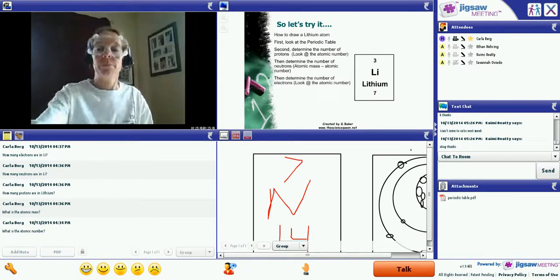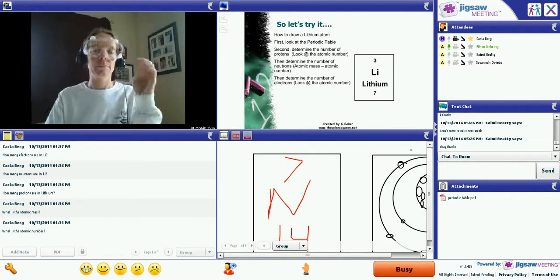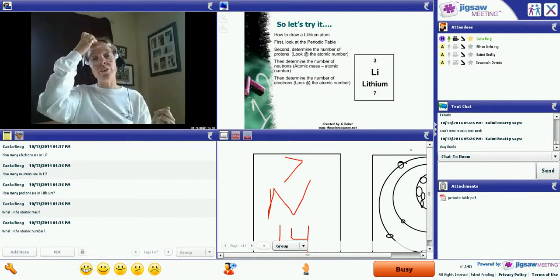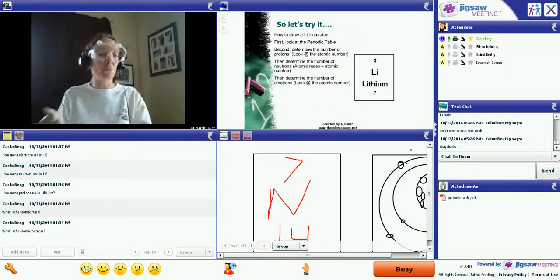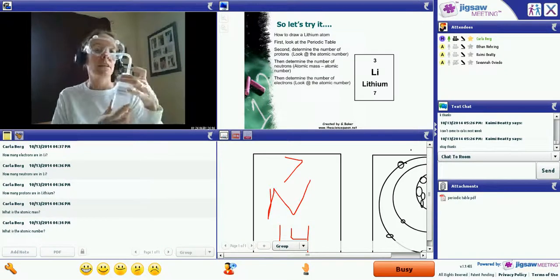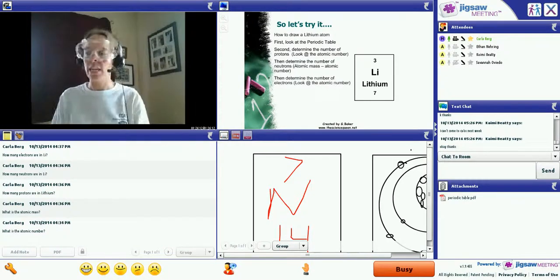Ethan, you have a question? If we can't rinse them in distilled water, should we just wash them with soap, like dishwashing soap? And should we wash the plates with dishwashing soap? Yeah, if you don't have distilled water, you don't even really need to use soap on it. Just rinse it out real good with water. The distilled water is just as you're doing the labs. Some of the labs want distilled water, so it's filtered. But for rinsing it, it's going to dry. Not a big deal at all. You can just use regular water.